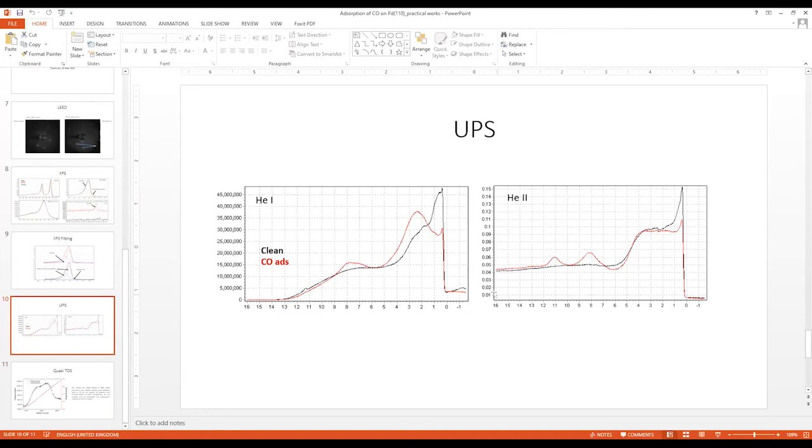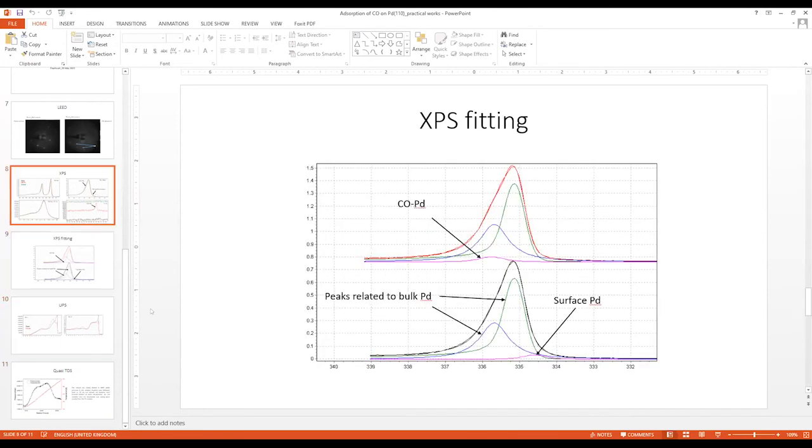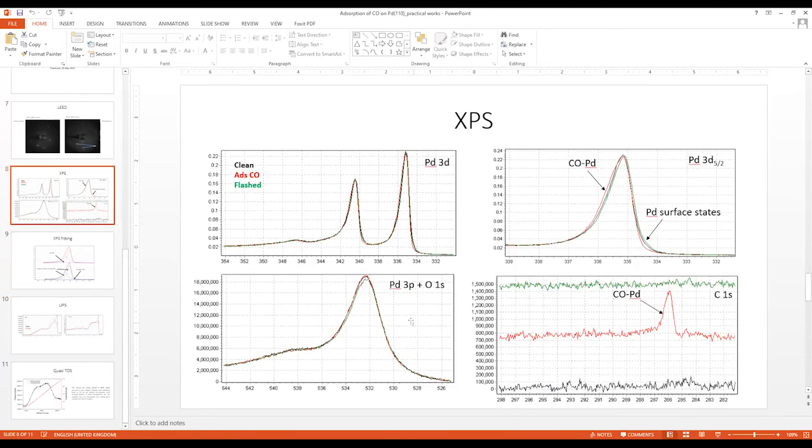We are waiting for a good time when we can open the cell, vent it, and bake everything, because after opening the cell we need to wait. I think in the shutdown in the second half of the year, we will test everything and prepare. So at the moment we can only do experiments which are UHV. So we can measure with the UV lamp in UHV, I mean, in the UHV manipulator without the cell. If you want to do measurements in the presence of gas, it will be possible maybe only after some time.